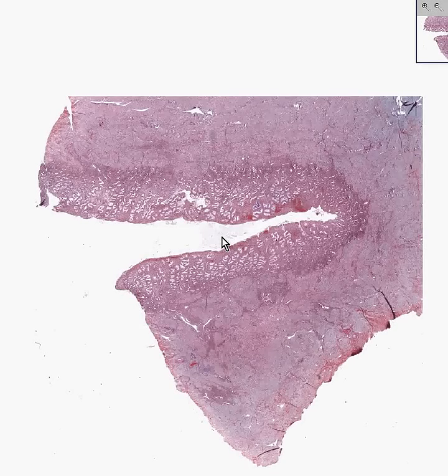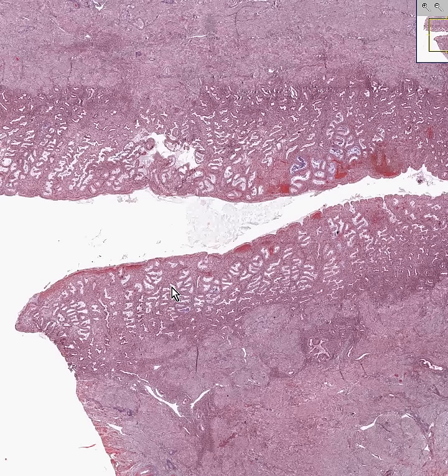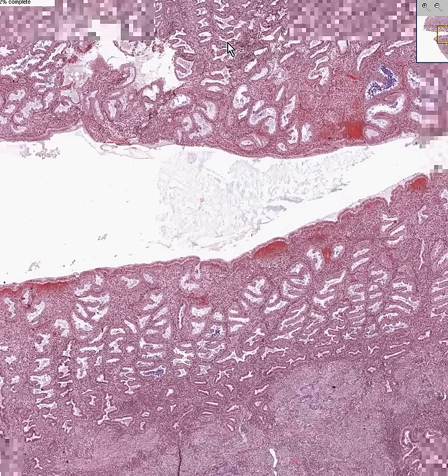Here is another endometrium. Compared to the proliferative or pre-ovulatory endometrium we saw, which is really only about a millimeter thick, the secretory or post-ovulatory endometrium, which this is, is generally twice as thick — approximately two, three, maybe four millimeters.